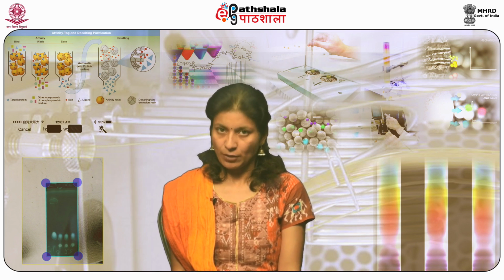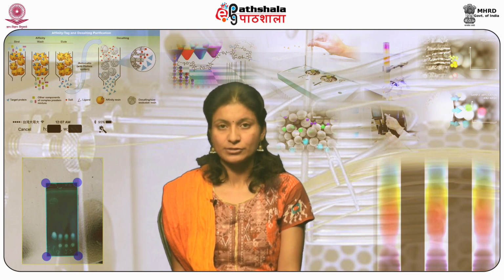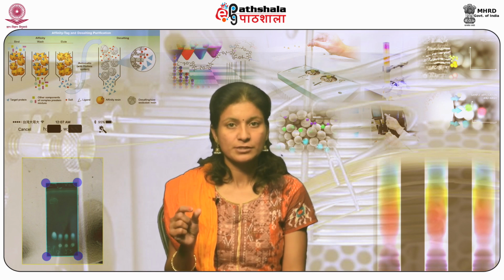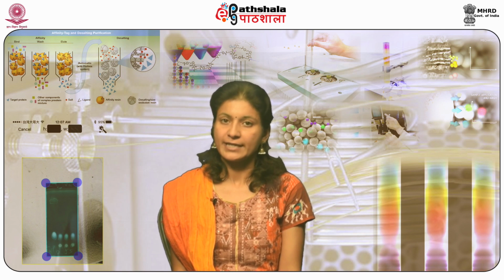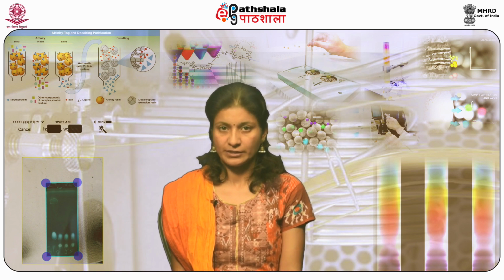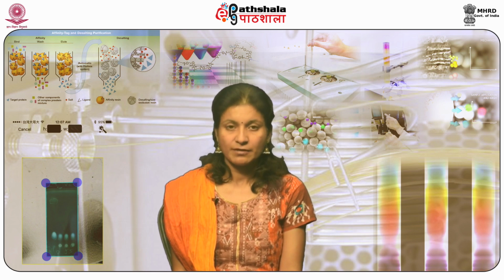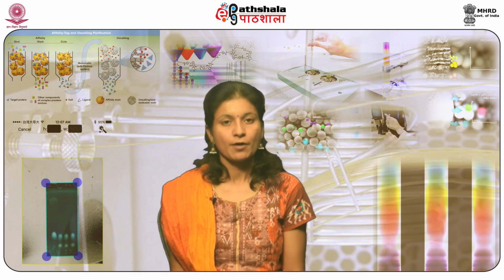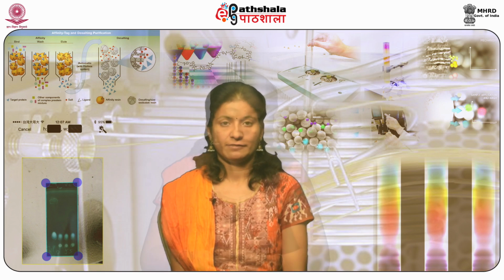Very minute amounts of a substance, that is parts per billion concentrations in gaseous samples, or picomoles of a substance in 1 ml liquid sample, can be measured with the help of gas chromatography, but it is often required that the sample must be measured in comparison to a sample containing the pure suspected substance known as a reference standard.